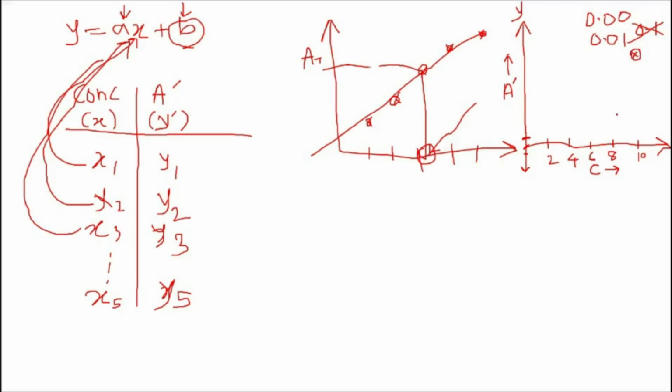Okay, मैंने ये point plot किया, वो एग्जामिनर को दिखेगा तो चलेगा. अभी मैं बताता हूं आपका y इंटरसेप्ट और ये जो पॉइंट अभी आपने प्लॉट किया है उसको कनेक्ट कर दो. You connect that point, so you will get a line with y-intercept and passing through the highest concentration.